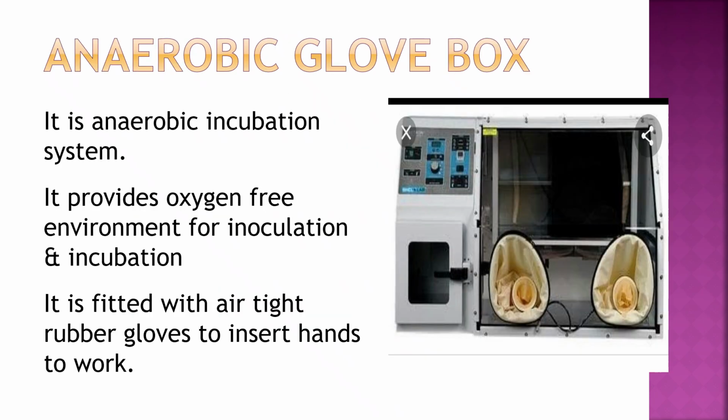Next method is the anaerobic glove box. It is an anaerobic incubation system. It provides an oxygen-free environment for inoculation and incubation. It is fitted with airtight rubber gloves to insert hands to work.